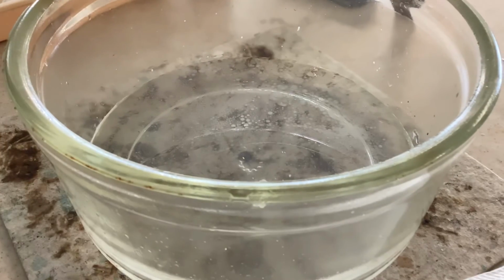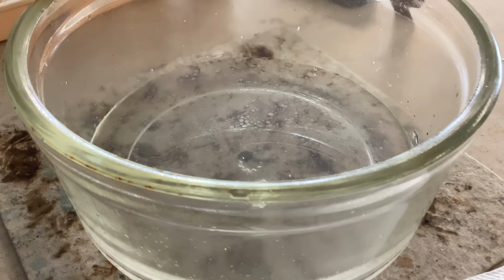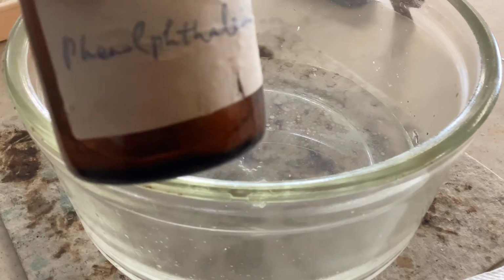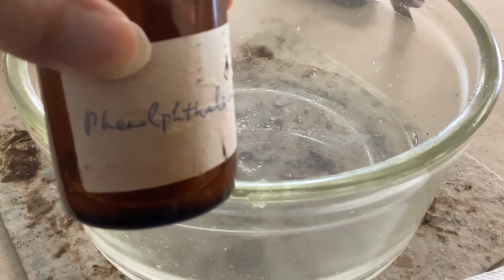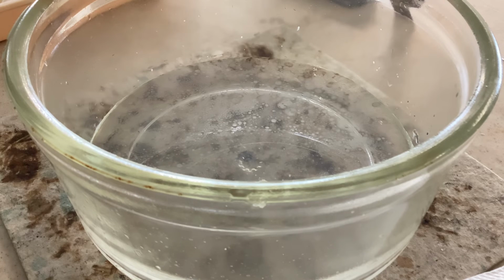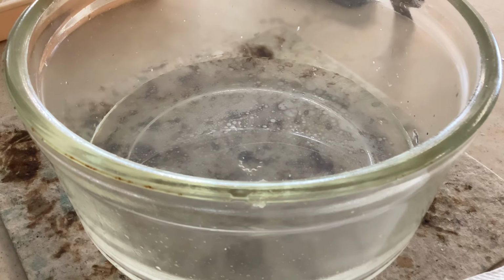Oh, and to show you that, we have to make use of an indicator called phenolphthalein, and this is an acid-alkali indicator. In an acidic environment, it is colorless, and in an alkali environment, it is red or pink in color. And let's drop several drops of it into the solution.